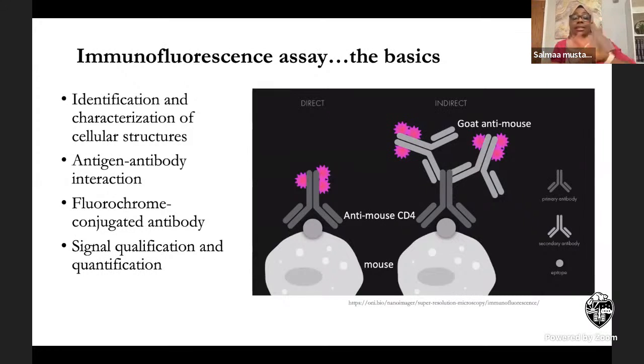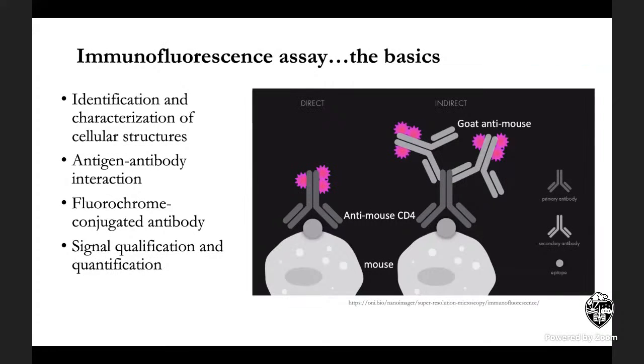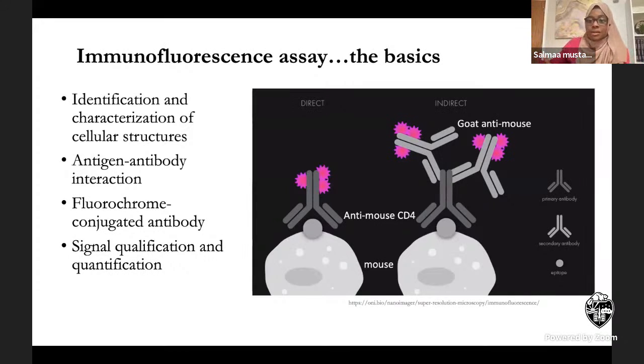Even if I had several cell lines, I would put maybe 24 hours post-infection in different wells, and then a separate well would be for my controls. I always use either the far end wells or the lowest ones, so there's no spillover while I'm titrating or pipetting. I usually leave some space between the infected wells, my real samples, and the controls. And learn to change your tips.